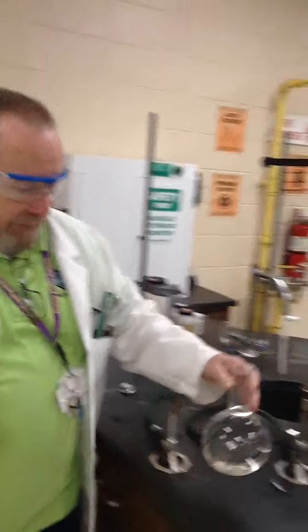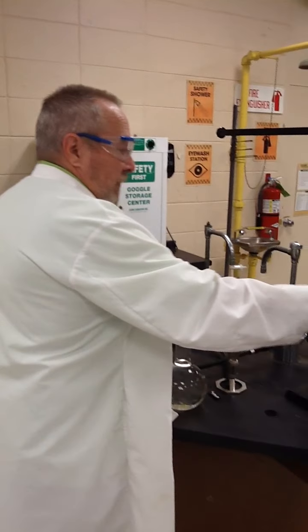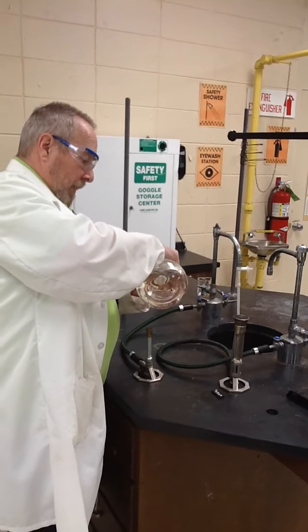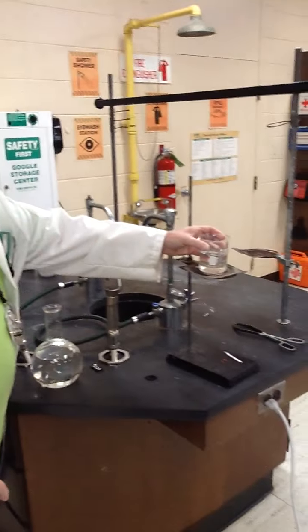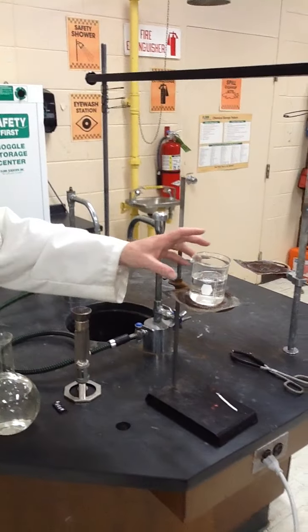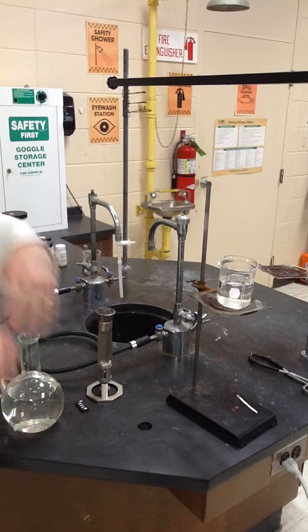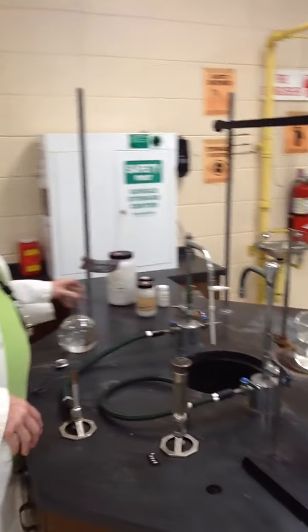So, one of the problems that we have is that I use ultra-pure purified water, and I clean my glassware very well. And it is possible to heat the liquid up above 100 degrees so that when this water has been heated up above boiling and it doesn't boil, that water will be superheated, and the smallest bump will cause it all to boil out at once. Extremely dangerous and something we want to avoid.